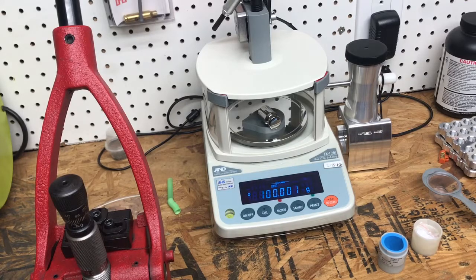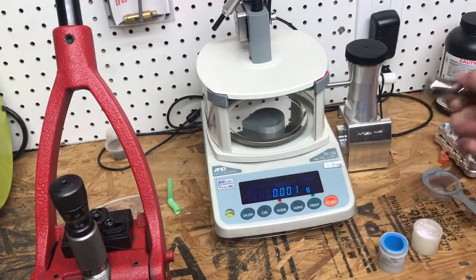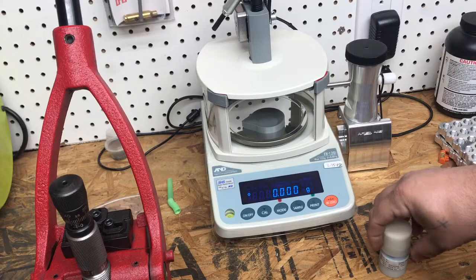It's reading 100 grams — it settled right there. It's a little drafty in here with the windows open, but your scale is calibrated. That's about it. You can remove the calibration weight and get on your way using your calibrated scale.